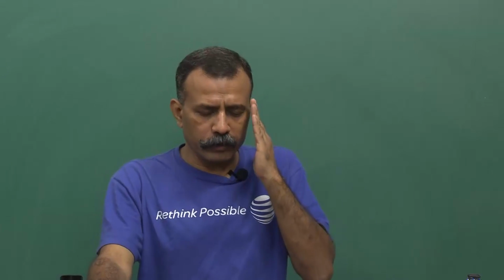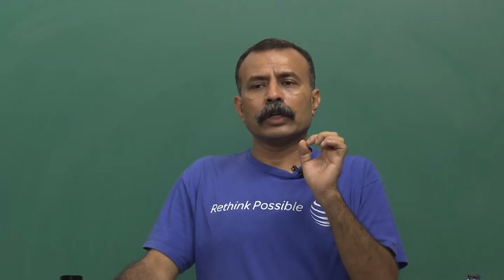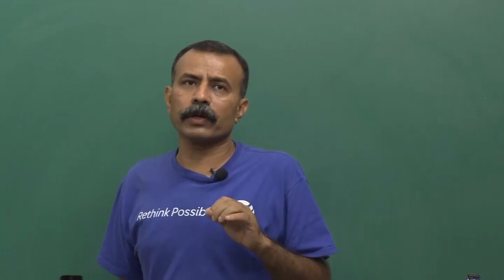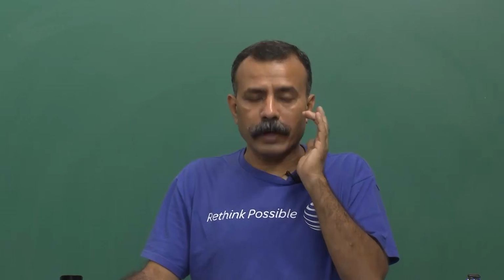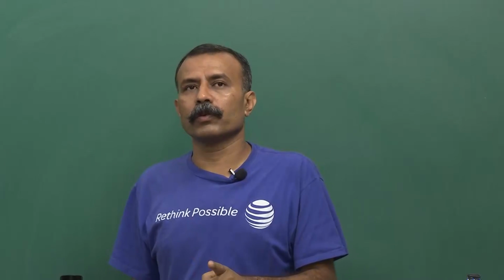And here is my word of caution. This dissection process, especially for the embryo, is a tricky process, so do not spoil your eyes by having a bad microscope for that purpose, because it is a pain. You will not be able to locate the tissue right if you have a bad microscope.